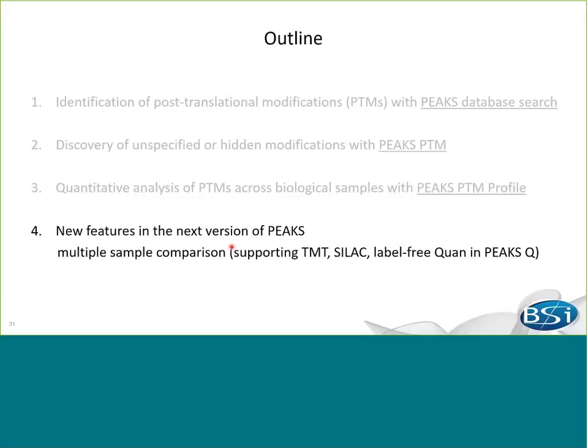Lastly, I would like to briefly show you some new features related to PTM analysis that will be integrated in the new version of PEAKS. We hope that these changes will help you to make your analysis easier in the future.